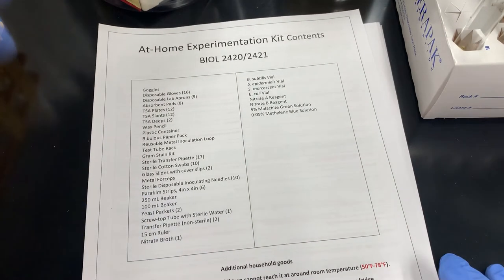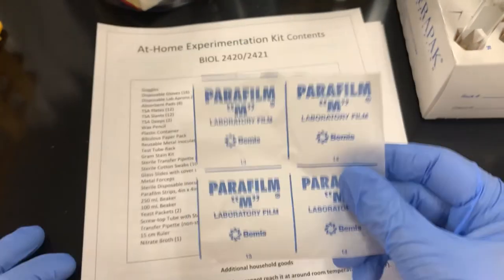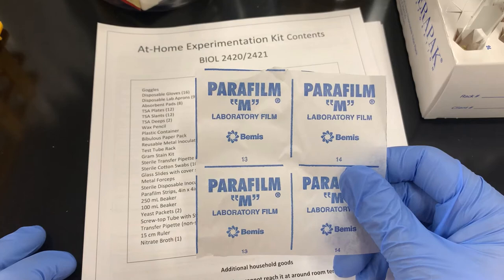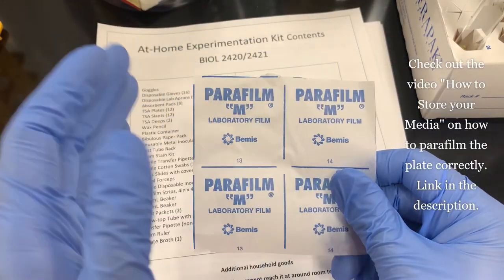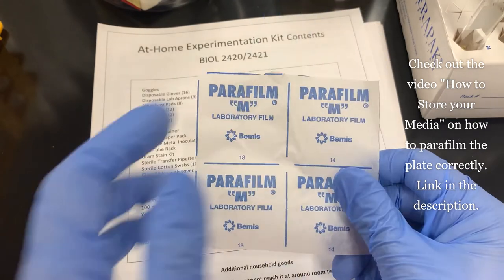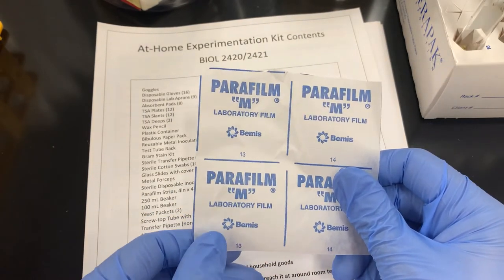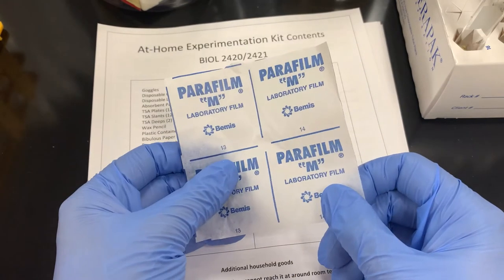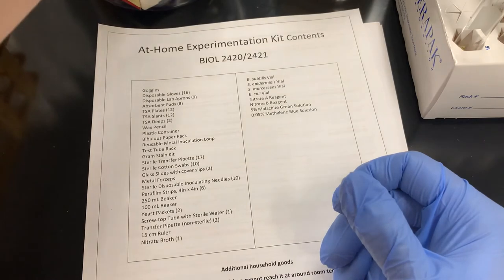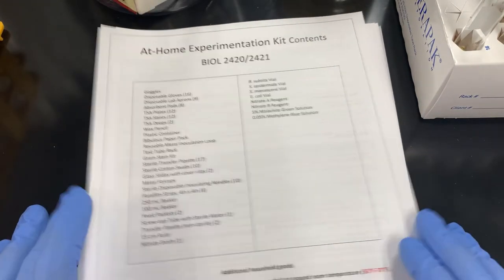Then we got parafilm strips. This is a strip of parafilm. This is going to be used to wrap your agar plates. Now, you don't need this whole thing to wrap an agar plate. You need to cut this into four, okay? We'll go over that in how to streak a plate and wrap it, okay? But you're gonna cut this into four. I'm gonna show you how to use it, so stay tuned for that video. You get six of those, so you can make 24 strips.